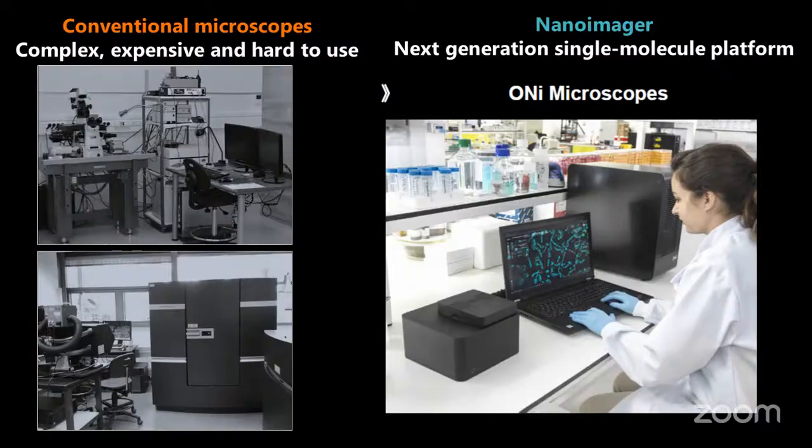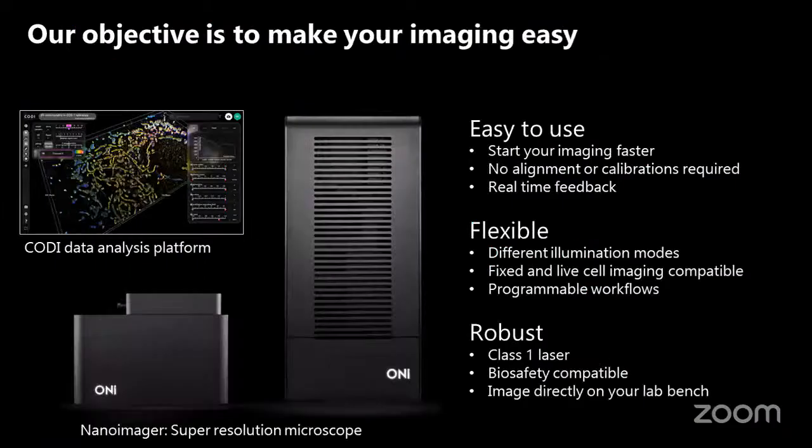And this is a laser box, what you see here. This is the only laser box you have. It is the size of a UPS CPU. So that's how small it is.